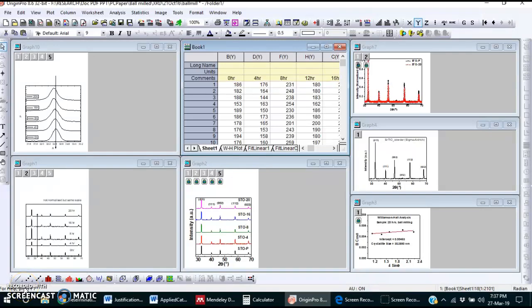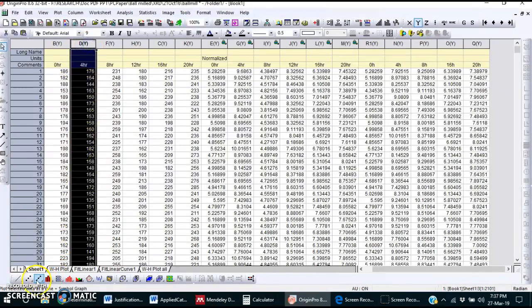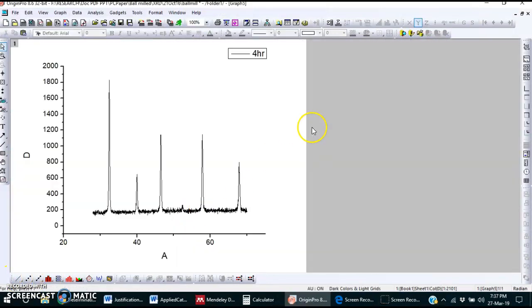Hello everyone. In this video, I will explain how to calculate strain and crystallite size. First of all, we need to fit the peaks of XRD. So, let us select any XRD pattern. This is our XRD pattern. We need to plot the WH plot.